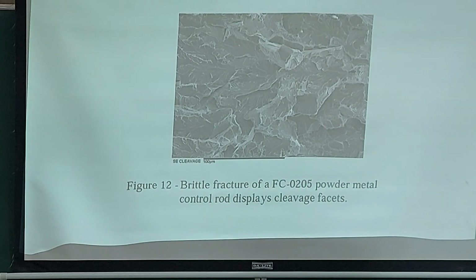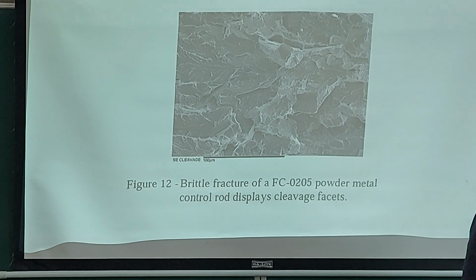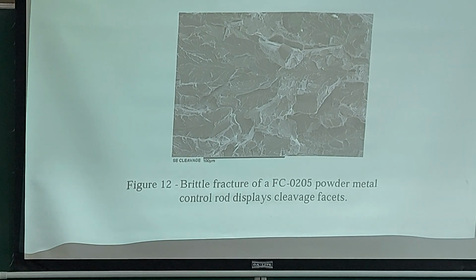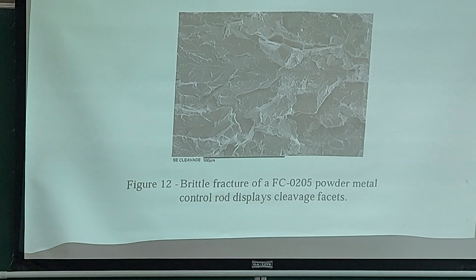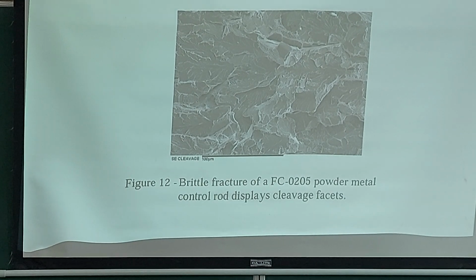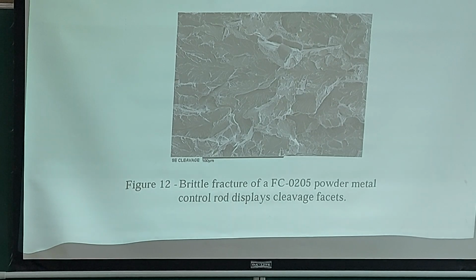And can we do something about quantitative fractography here? Can we relate any of the dimensions to the fracture toughness of the material in this case? Maybe the length of the river line, the step of the cleavage tongue.